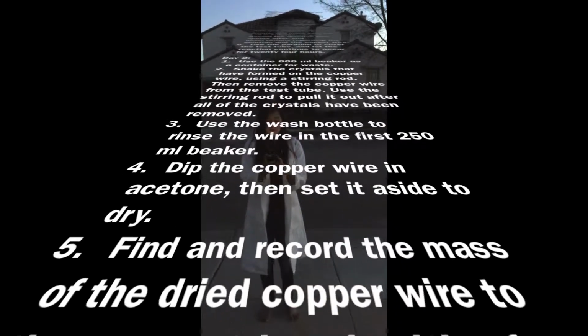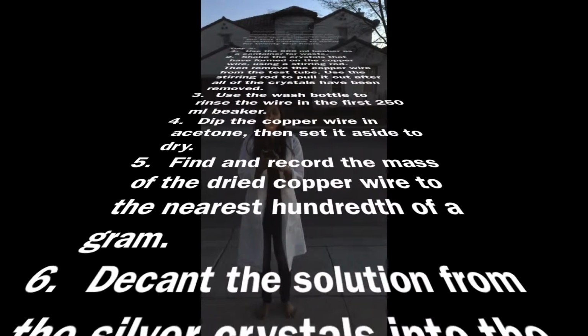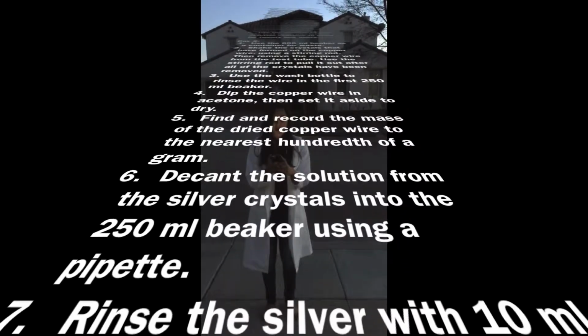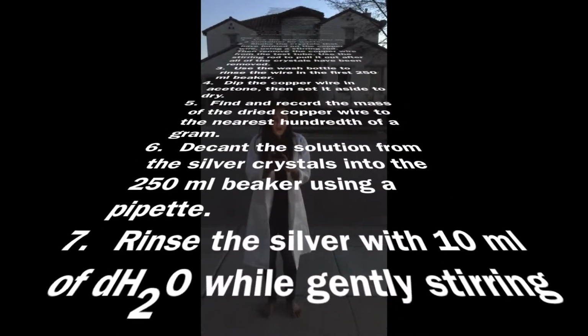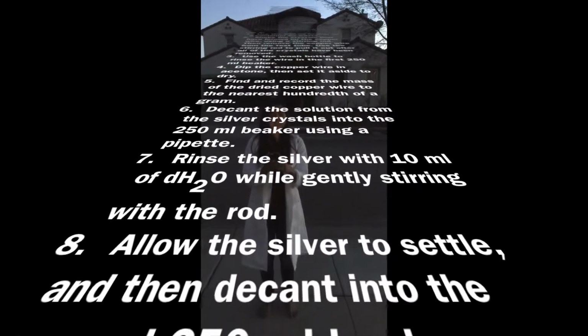Step 3. Use the wash bottle to rinse the wire in the first 250 milliliter beaker. Step 4. Dip the copper wire in acetone, then set it aside to dry. Step 5. Find and record the mass of the dried copper wire to the nearest hundredth of a gram. Step 6.